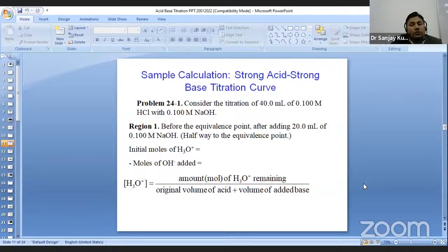Suppose, with the help of an example, we start with the initial reading of 0, and we got a reading of 25. Then for the second reading the initial is 25, and then we go for 48 or 52, like that. So go for the third, fourth, fifth reading, and in that we select the best two readings nearby each other. So with this I conclude my topic, and in future we'll try to implement this with a new topic. We will meet you next time.